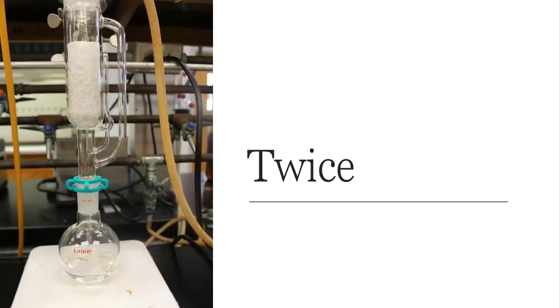So I do that twice, just to help ensure that I put enough solvent in here, because the last thing that I want is to heat this flask up and all of the solvent be up here in the thimble extractor, the Soxhlet extractor, and no more solvent down here to fill this up with. Then the whole process stops. The only thing I'm doing is heating up an empty Florence flask at that time, right? And that doesn't make any sense. So this helps me ensure that I have enough solvent in the Soxhlet extractor, so that it will be automated and it will extract for hours and hours and hours without me worrying about it.